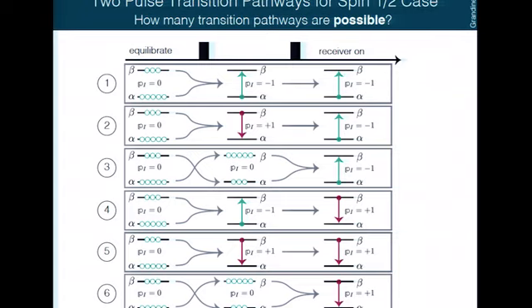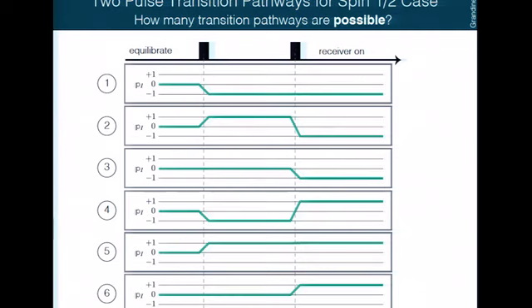And you see I have written down the p-values for all of these guys, for all those transitions. So the notation that we all use is to simply not do a diagram like that, but do a diagram like this, where we trace out what the p-values were throughout this pulse sequence. Now, when we do this experiment, I said we can only detect p of -1.